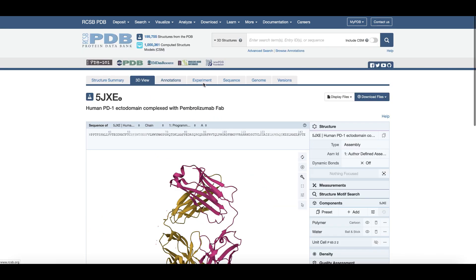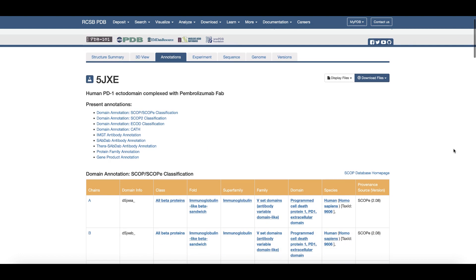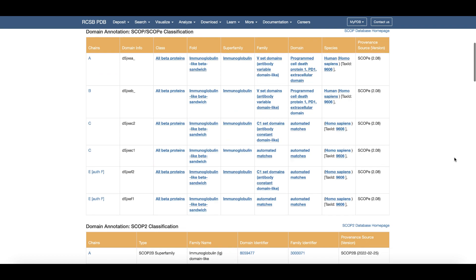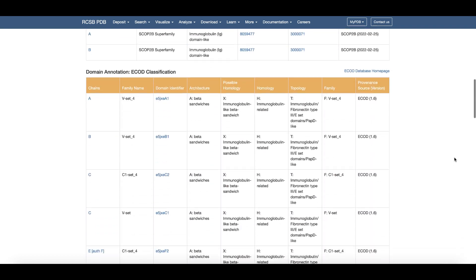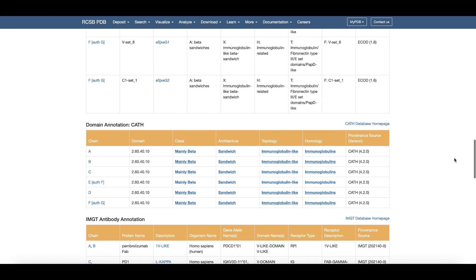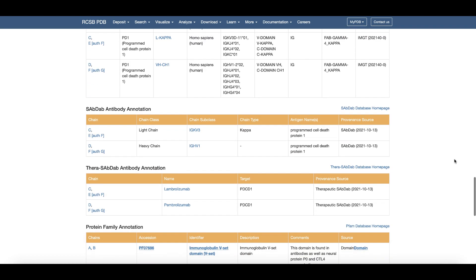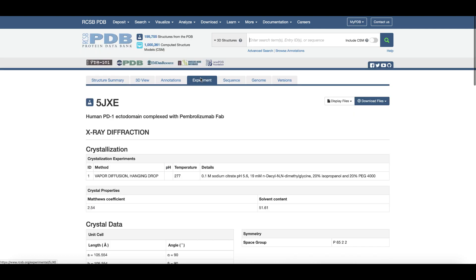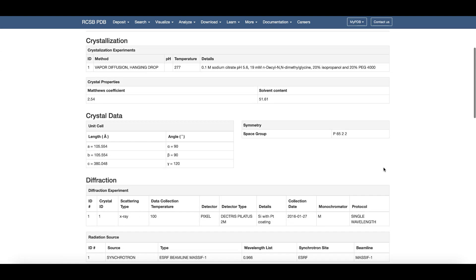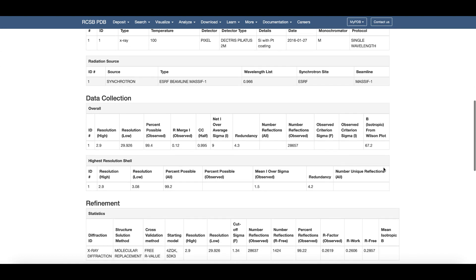Clicking on the annotations tab provides information integrated from various structure and function classification resources, and in this case, information from immunoglobulin databases. The experiment tab lists crystallization, data collection, and refinement details.